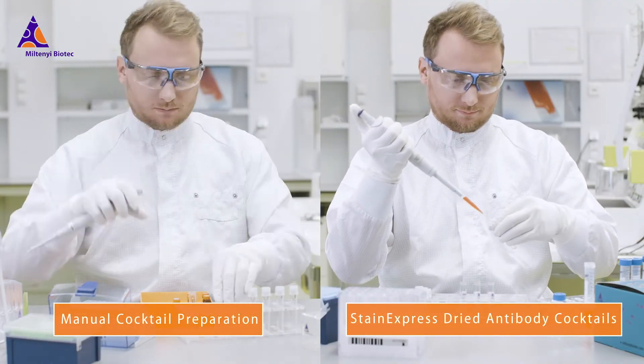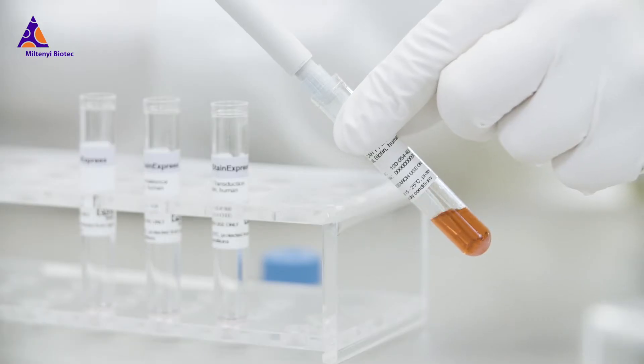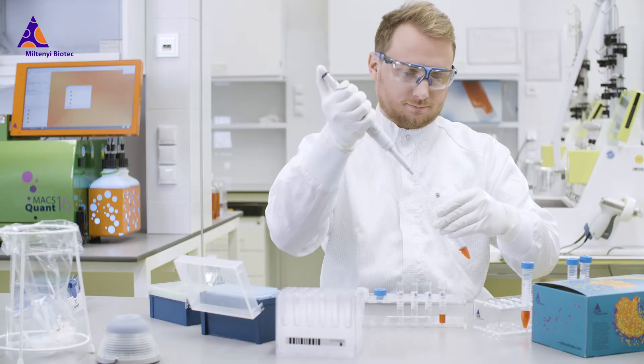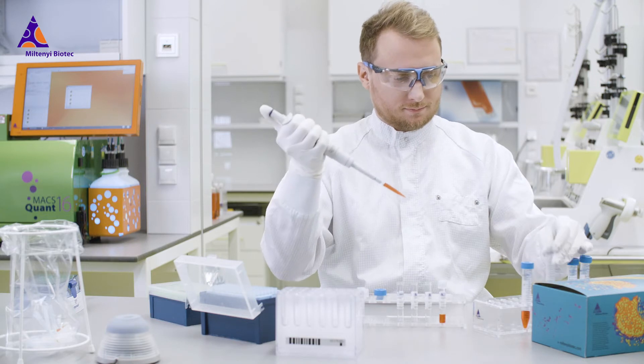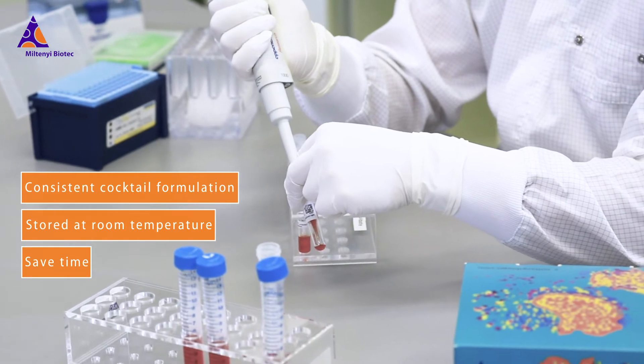Thankfully, dried antibody cocktails put an end to all that. They not only save time, but can be conveniently stored at room temperature. Moreover, they guarantee consistent cocktail formulation for reliably standardized results.